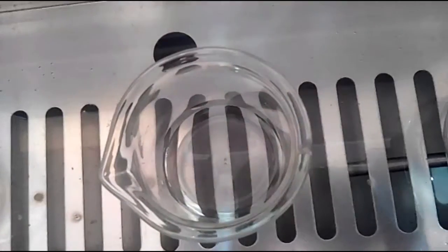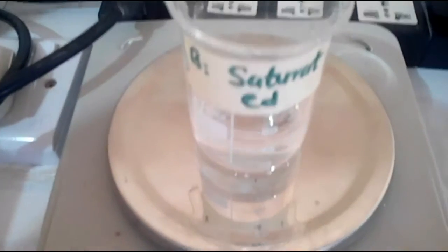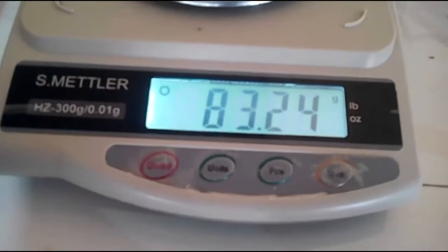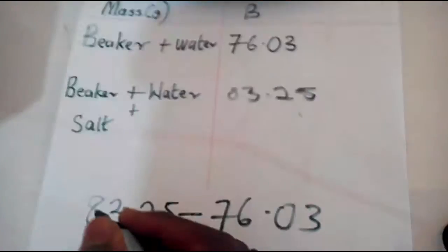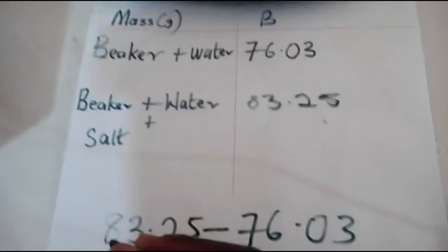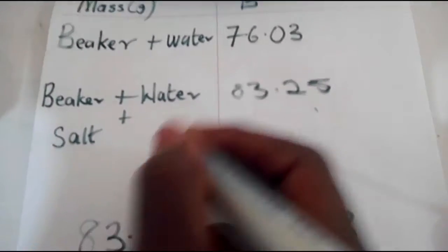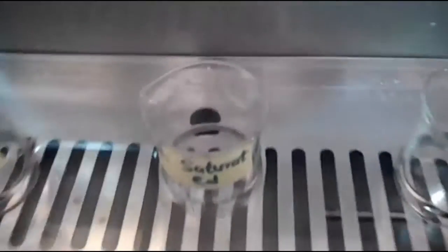This solution and the beaker will now be weighed. The weight of the beaker plus water plus salt is 83.25 grams. To find the mass of sodium chloride that completely dissolved in 40 ml of distilled water at 30 degrees centigrade, we subtract this from this, which is this. 7.22 grams of sodium chloride is needed to form our saturated solution.